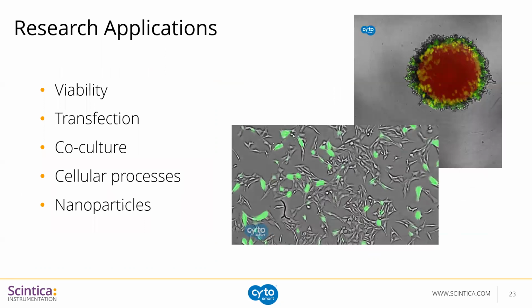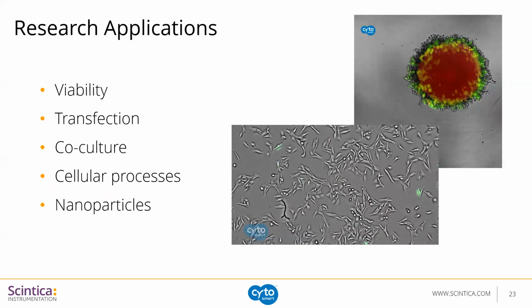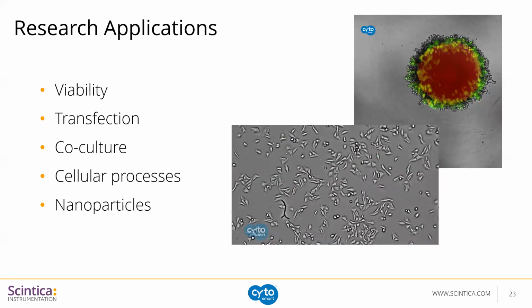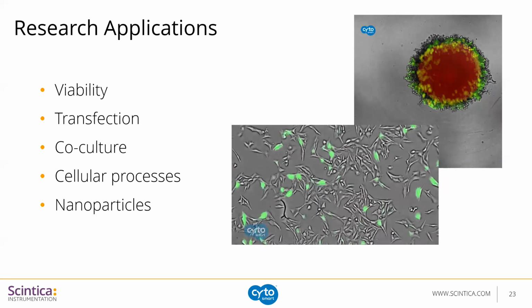So what are people using this for? Compared to the Lux2, I think many are using it for viability studies. So either something similar to what I just showed, or using a dye to show when cell death is occurring.